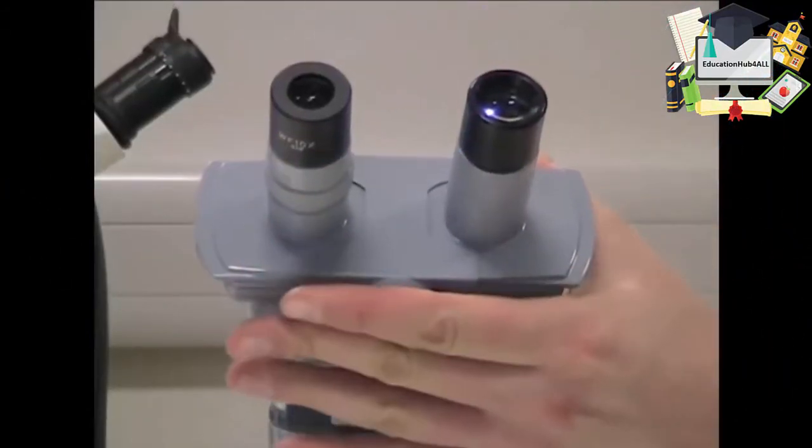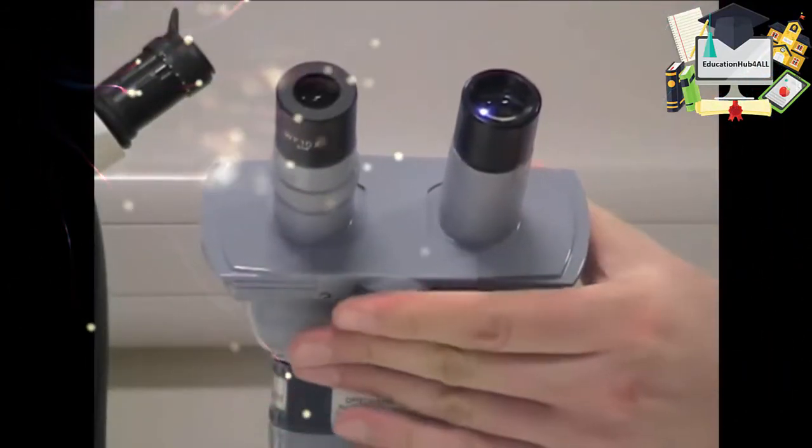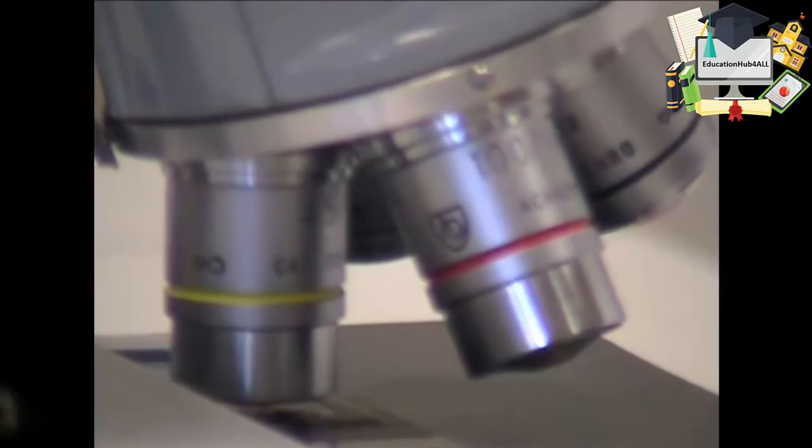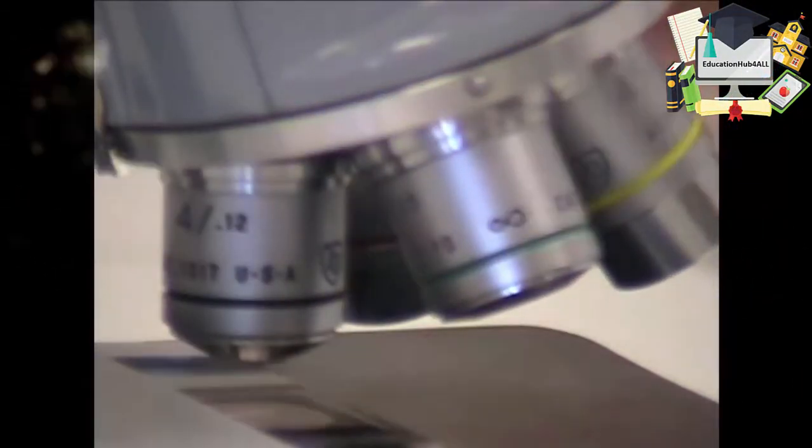Adjust the distance between the eyepieces so that when you look through them you see a single image. Now we're ready to focus the microscope. It's best to start off with a low power objective. At the moment this is on the x45, quite a high one. You can read this number from the side of the lens. We're now using the x4 objective lens.